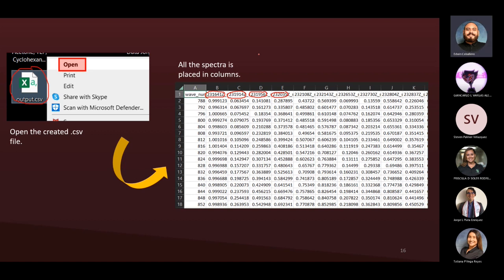So what I usually do is that once I know the numbers of each of my samples, I have a notebook, and in my notebook, I place the name that the instrument gave the sample, let's say sample 1, and I create a column telling me and the other person who is going to see the file that sample 1 equals a sample of TNT, for example, and is the first replicate. So you can either keep this in your notebook or you can change each of the columns.